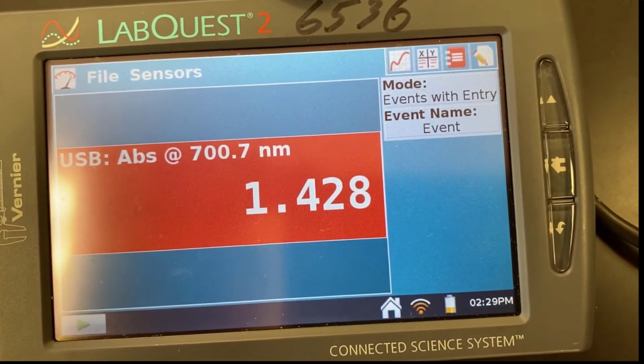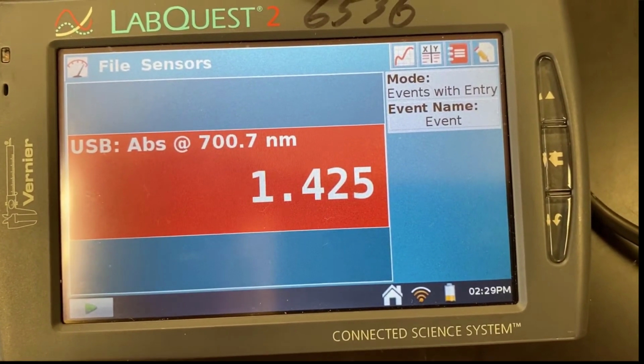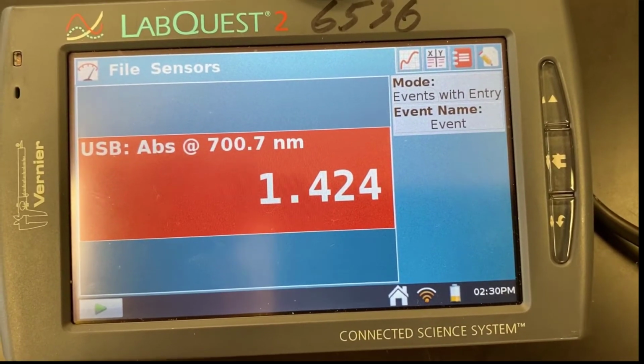Okay, so now we need to understand the graphical relationship between the concentration of each solution and how much light it actually absorbs.